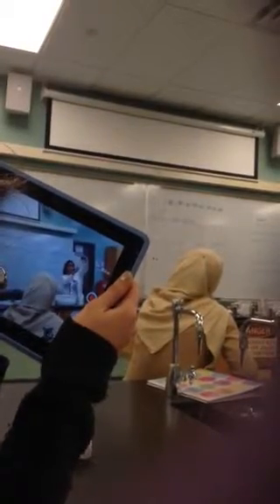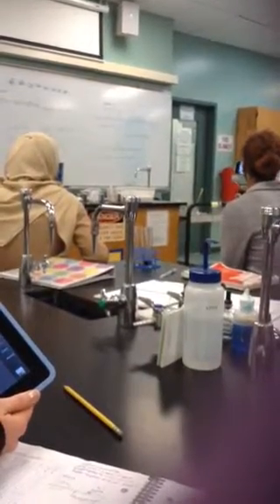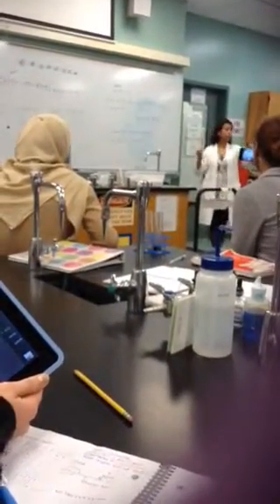When you do the Benedict, it's supposed to recognize the glucose solution. So it's supposed to make, like I said before, a reddish brick-looking precipitate. Here I don't see a reddish brick-looking precipitate, however, it's darker than the other. So you do have some glucose in solution, it's just not enough. You see it's even darker? You have to take the reading right away. If you let it go for too long, eventually it will also precipitate, so you see the change right away, because otherwise it gives you a false positive. That's what I was looking at before, when you guys were doing it.